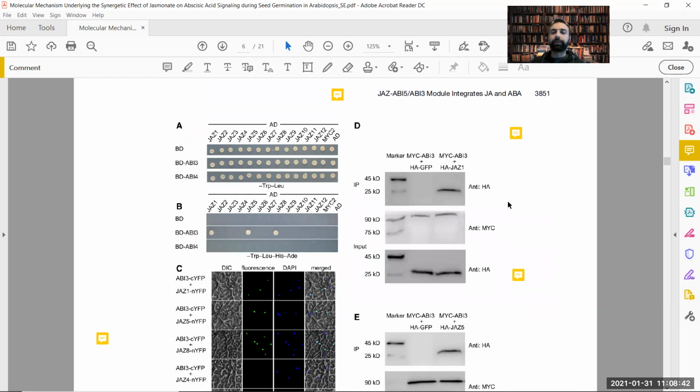Okay. How is immunoprecipitation done? I am sure you know about it. If you don't, watch a YouTube video. There, we express two antibody-tagged proteins in the same cell, and then destroy the cell and use agarose beads with antibodies to pull down one of these proteins.